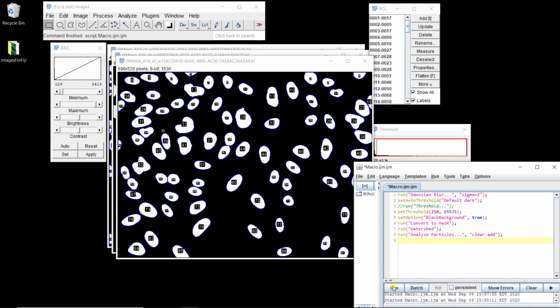Okay, you get it. So we'll see in the quantification session how we can do it even in a more efficient way, but it's just to give you an idea about what you can do, and you can see how macros can be powerful to both process a lot of images always in the same way, and even keep track of what you did for a given analysis.